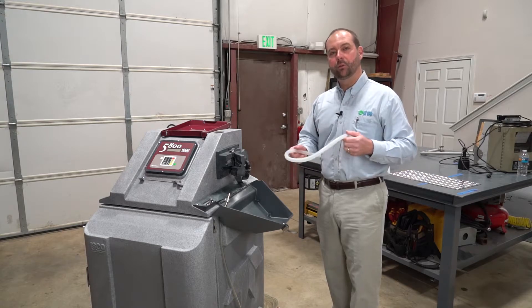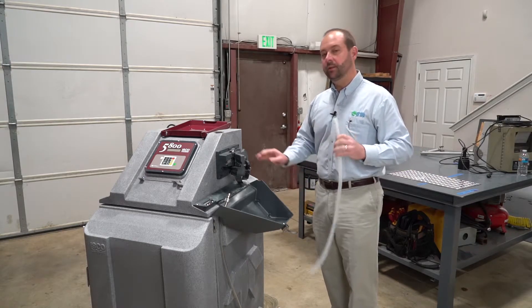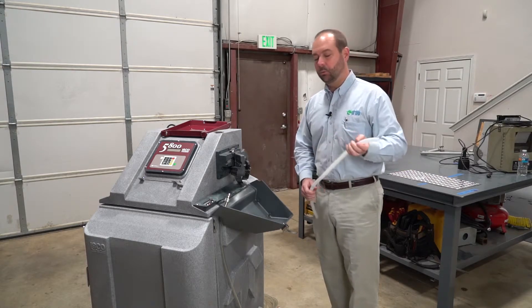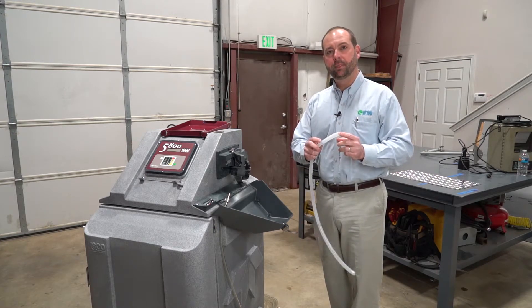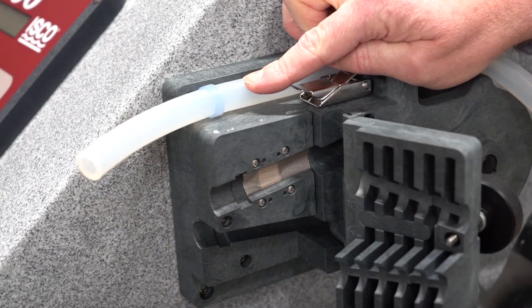Then we will want to take a new pump tube to insert into the pump housing. We want to make sure that the short end of the pump tube is protruding out the top portion of the pump assembly.